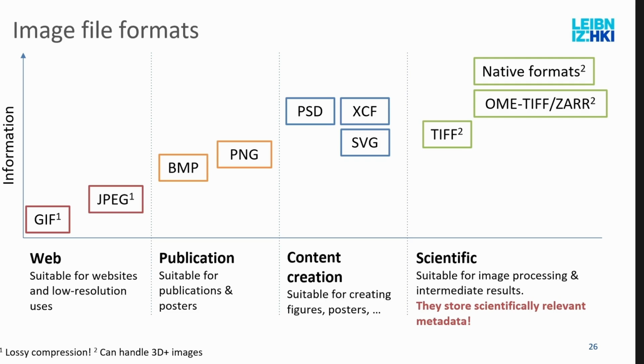Or the new format, OME-Zarr, which you probably have not encountered yet because it's not there yet. I will explain it briefly. And then ideally, when you are archiving something anywhere, better always have the native format. So even if you use OMERO, like an image database that is remote, put the native format there that the microscope produces, the LIF files or the CZI files, because they store all the metadata.